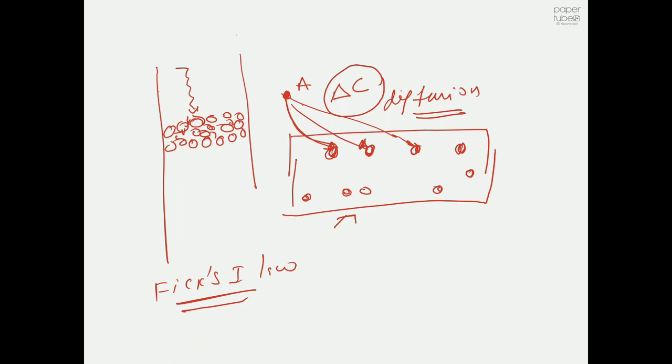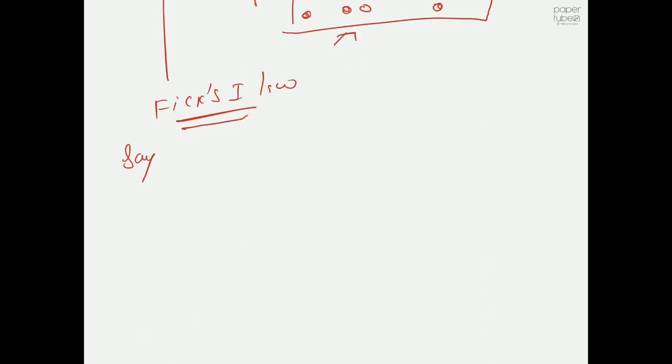And if you imagine, we are not agitating the column, we didn't add any pump to force the liquid. So everything happens naturally via diffusion, and the key driving force here is the concentration gradient. So what's happening is some adsorption is happening, and that adsorption is driven by diffusion, and that diffusion is happening because we have some driving force, and that driving force is nothing but our concentration gradient. So I hope you all remember up to this point. These are two basics, in fact. These are really basic, but what you need to do is just remember this process. But what is really happening is, say, at the moment we are dealing with the molecule A.